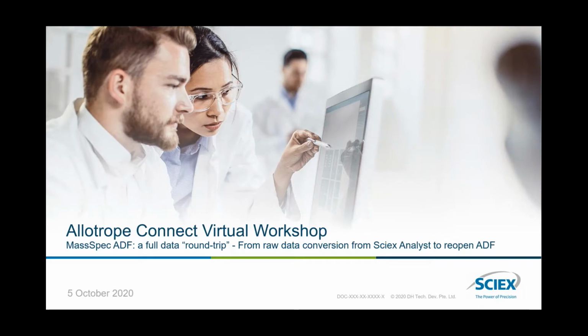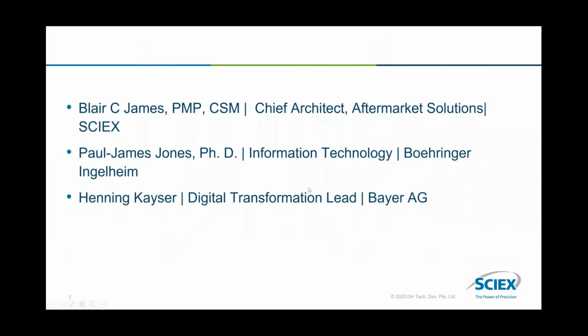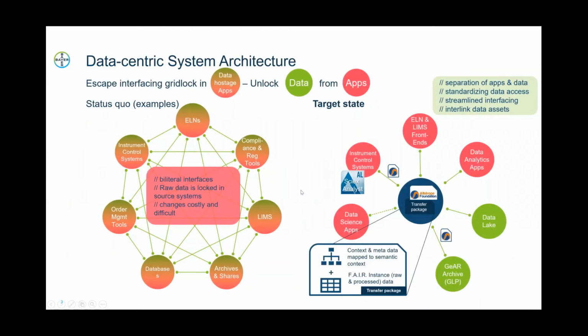A collaboration between SCIEX, Bayer, and Boehringer Ingelheim, we have created a conversion utility, an ADF-enabled add-on to the Analyst software to produce a pipeline enabling us to solve two particular use case problems that are pretty much universal to all organizations.